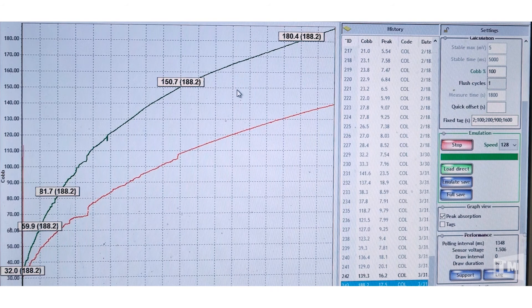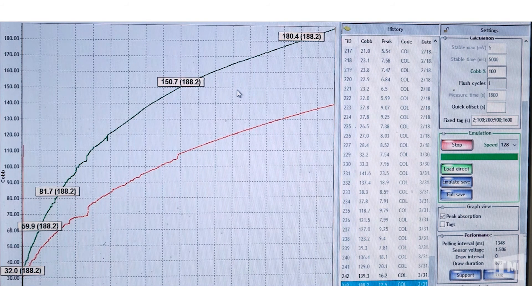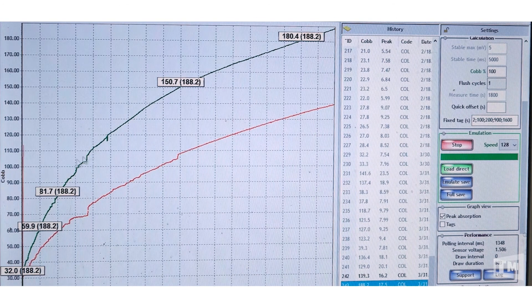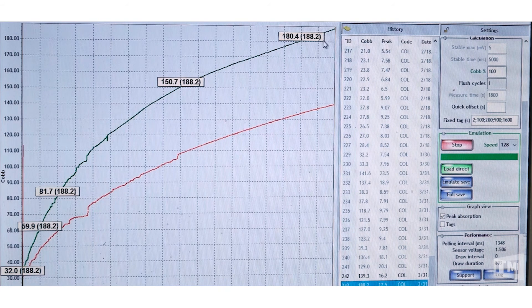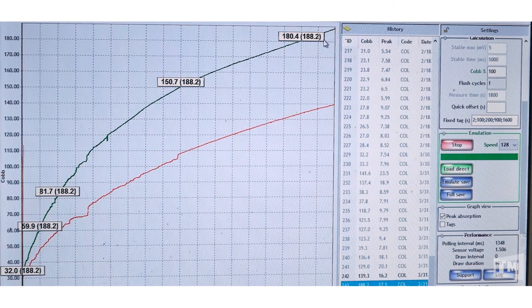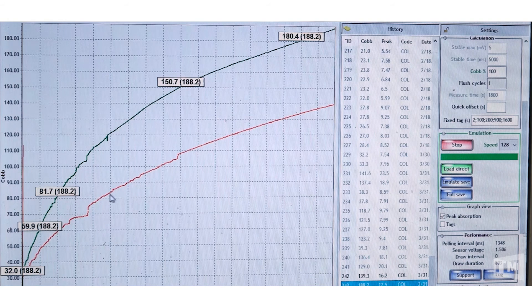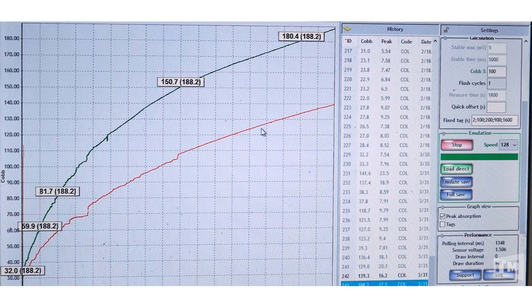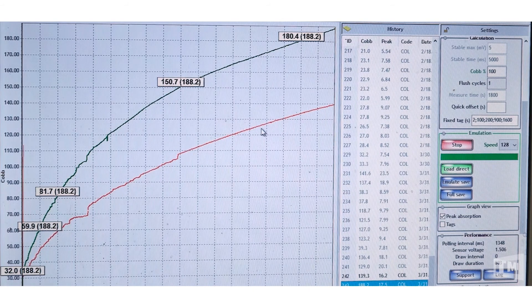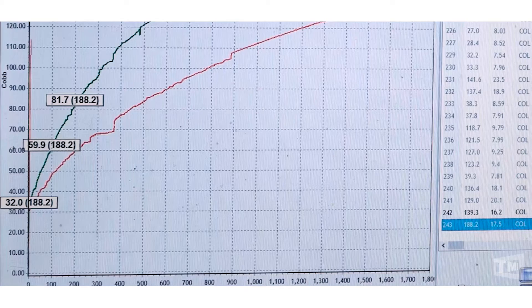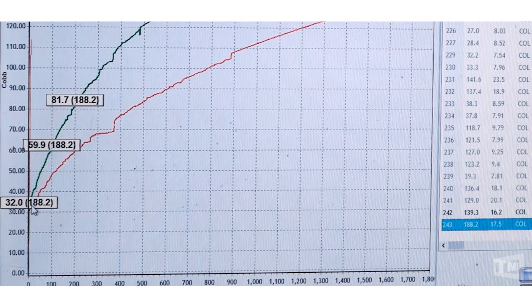This is an example of a 30-minute Cobb done on a liner, top and bottom, where this absorption rate over time is the bottom, and this one here is the top. As you can see, there's sizing differences from the top and the bottom. More importantly is what's going on here initially, which is the peak.